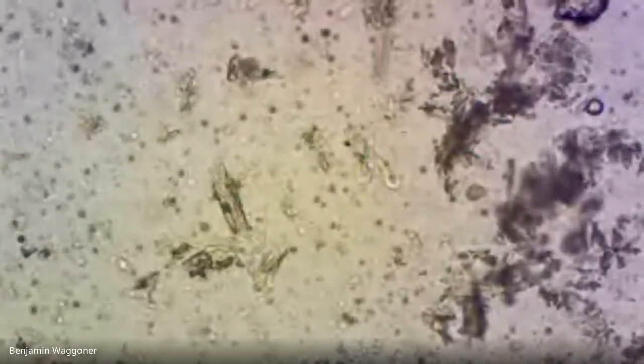All right, we've got a couple of little elongated symbionts right there. And if I can get those in focus.